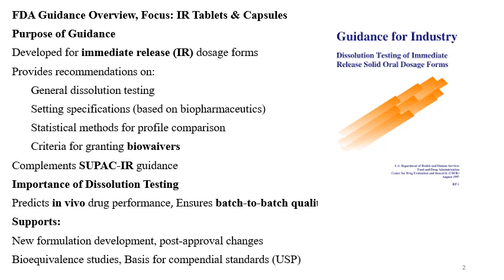Now, you might be knowing about the importance of dissolution testing. Dissolution testing is a routine quality control test. It predicts the in vivo drug performance, and it ensures batch to batch consistency and quality. It shows that the generic product will be safe and effective and equivalent to the reference formulation. If it is a novel formulation or new drug application, the dissolution testing predicts the in vivo behavior by the in vitro testing.